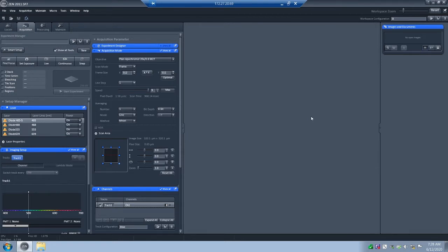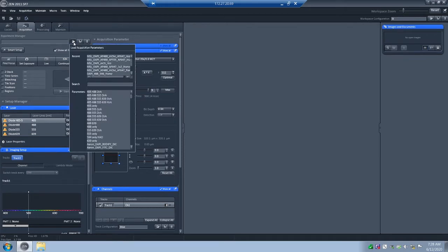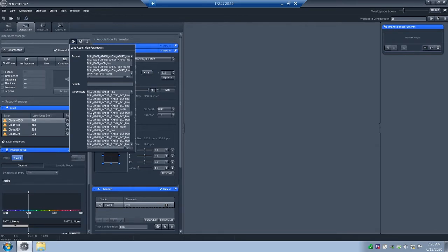The first order of business is we need to tell the microscope what fluorophores we are using. The microscope has no idea what fluorophores we're using, so we need to load a setting with the proper fluorophores. We do that by clicking on the button that says 'Load Acquisition Parameters.' In this list, we scroll down to parameters that start with MSL — those are optimal parameters that the core staff have created for different combinations of fluorophores.